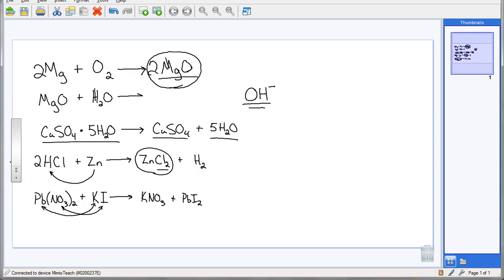Some of these are a little bit harder than others to provide that evidence for. We talked about solubility and solubility charts, so that would be one way to identify that the PbI2, the lead iodide, is insoluble, and so it does not dissolve in water, which is what gives you that bright yellow precipitate. So it looks like a chunky powder in the bottom of your test tube. So that would help explain what's going on. For most of these, you can provide evidence, but some of them are going to be a little bit more difficult. Again, if you have questions, let me know. Otherwise, I'll expect that you can get this turned into me before we hit the break. And good luck.